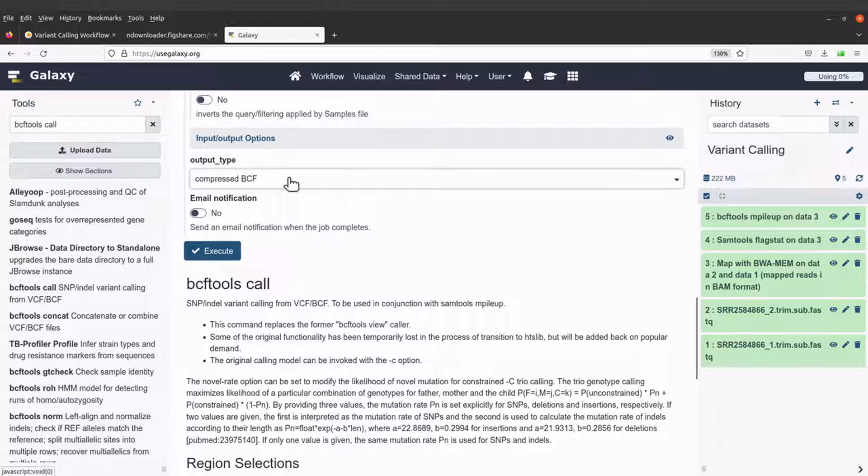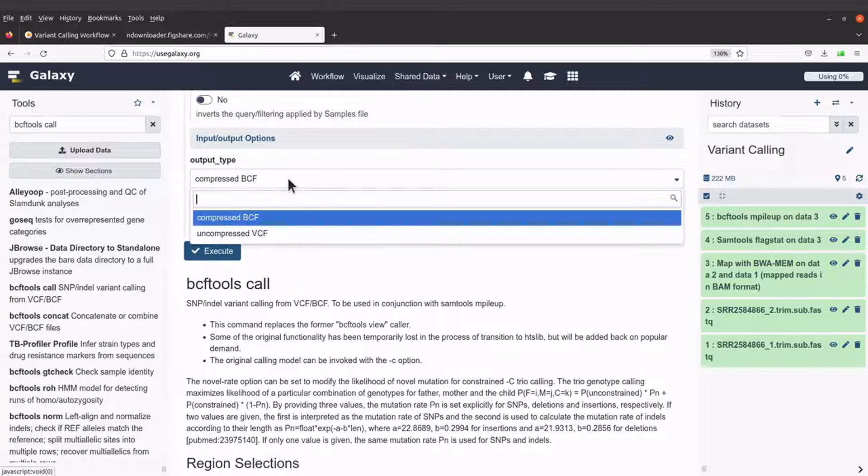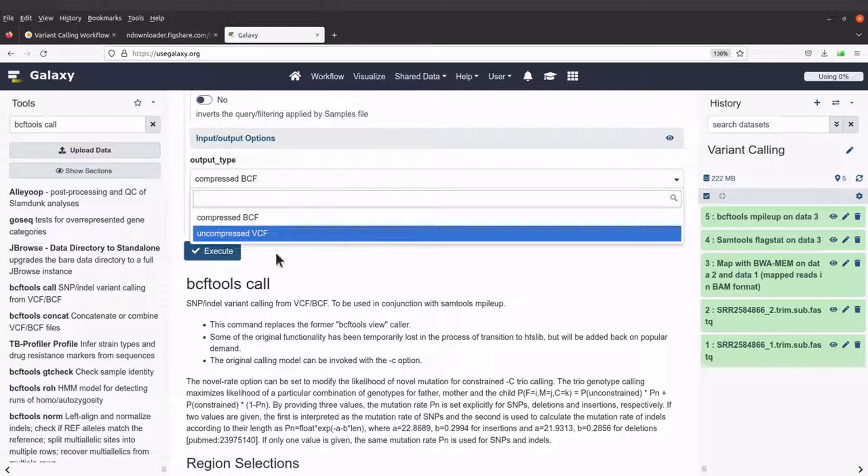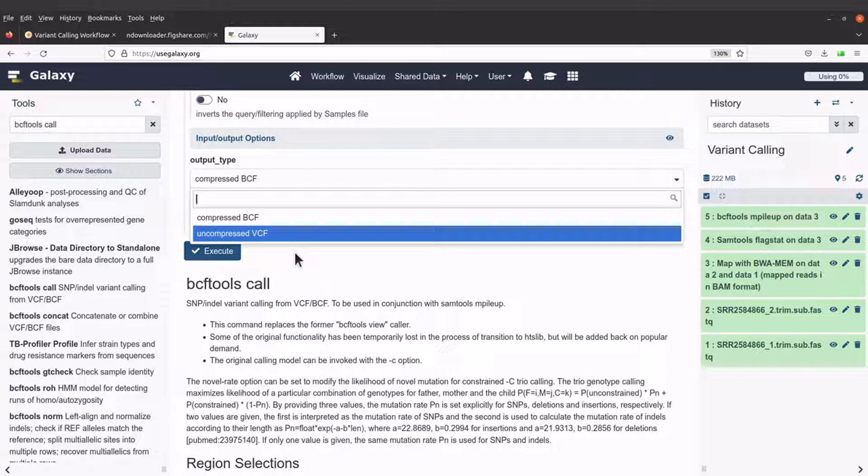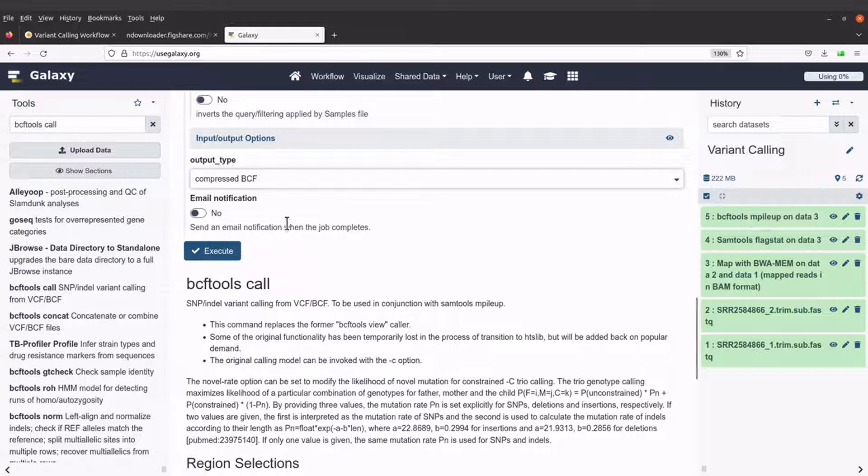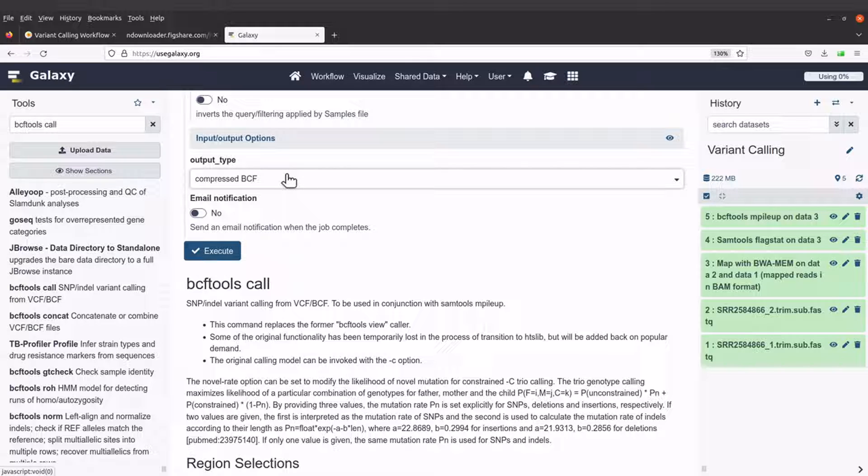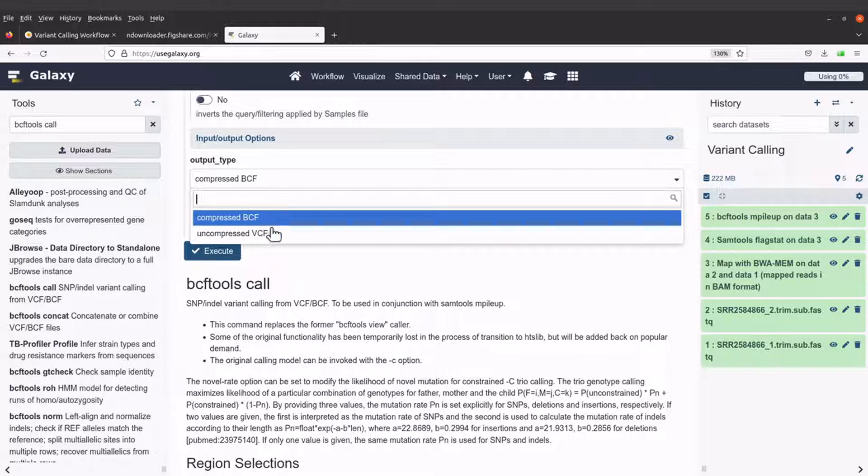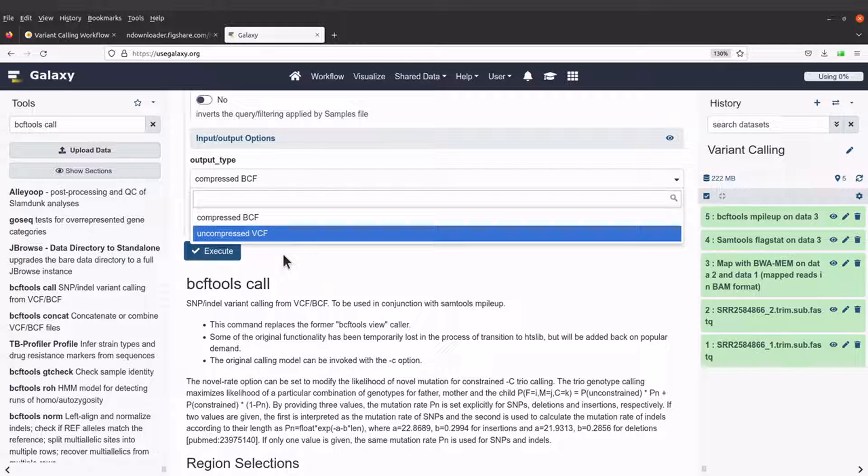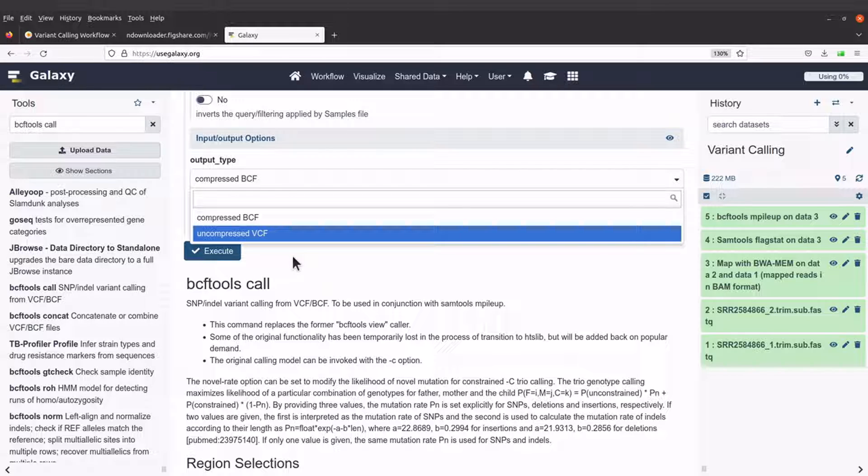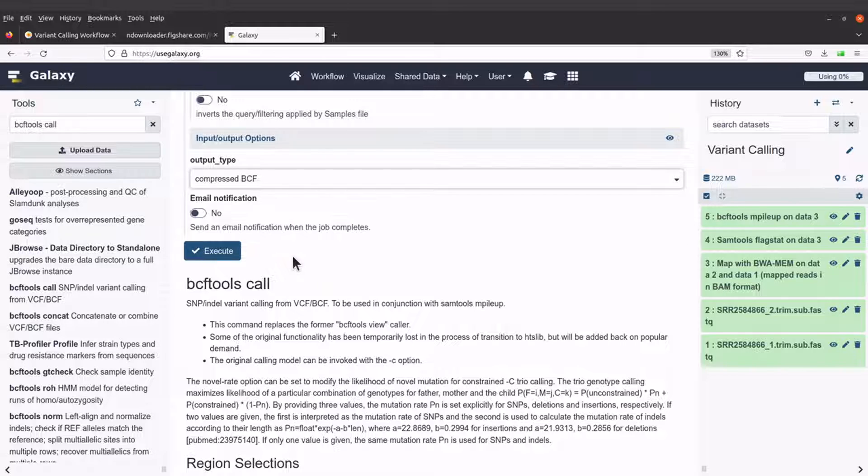Especially if you are going to use tools other than bcftools to process it, then you need to convert it to a VCF format. You can also use the uncompressed BCF format. It depends on what you want at the end of the day. If you use the uncompressed, that means your file is going to be large. So you still have to compress it.